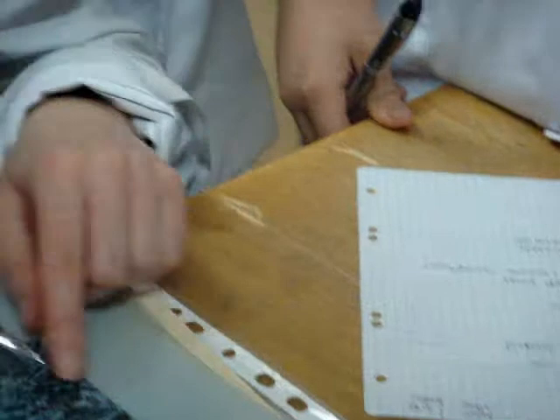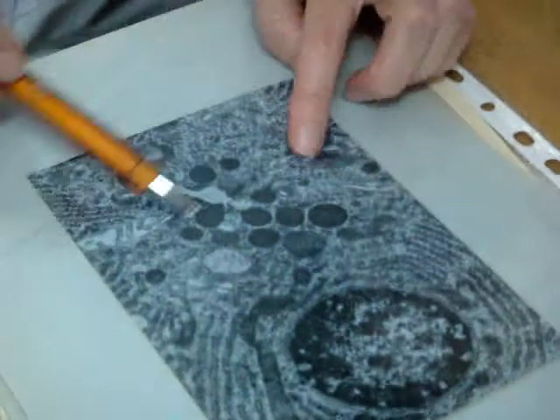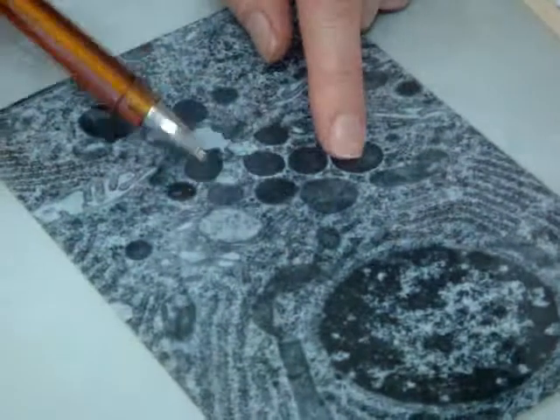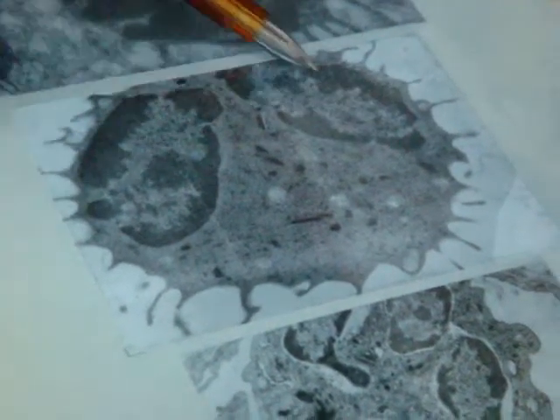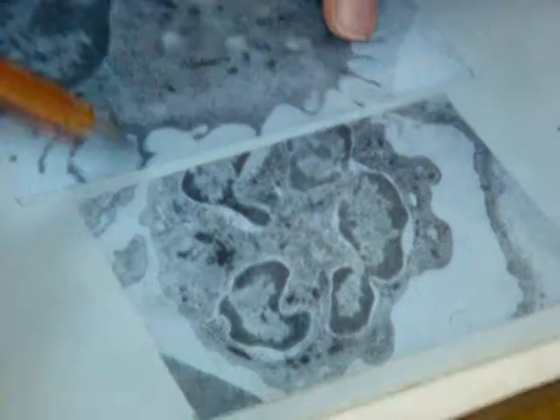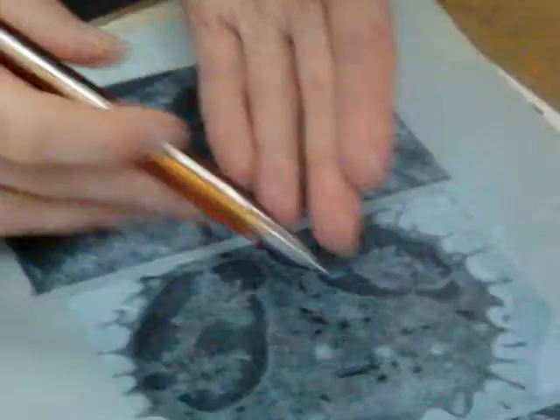Look please, this is one cell, this is one more cell. Junction between cells, rough endoplasmic reticulum, secretory granules, this is glandular epithelium. They form a canal to transport secretion. And this cell without basement membrane belongs to connective tissue, with such processes and segmented nuclei, so this is a cell of blood. Some of them are in the lumen of a blood vessel; when a cell leaves the blood vessel, they form pseudopodia for movement. That's why they look like this.